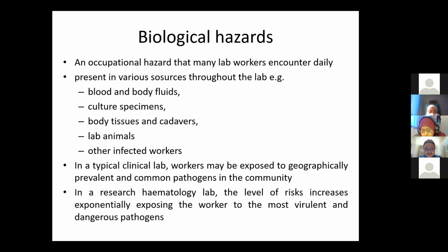In a research hematology lab, the level of risk increases exponentially. If there is an HIV case, the risk would be higher. In certain research topics, they may be focusing on a particular disease, so the most virulent or most dangerous pathogen could be exposed to the people in the lab.